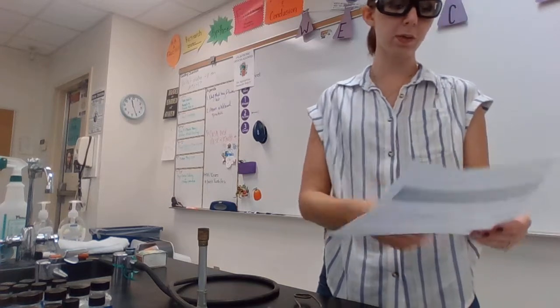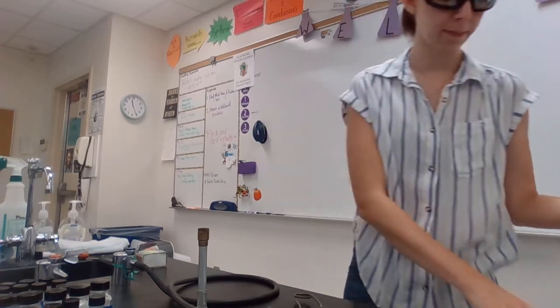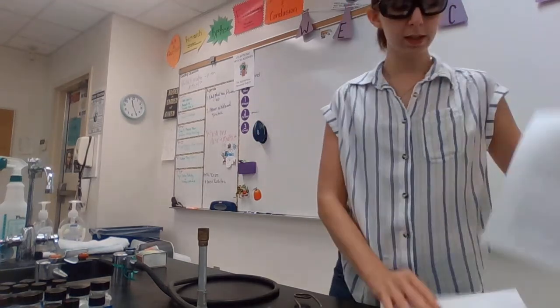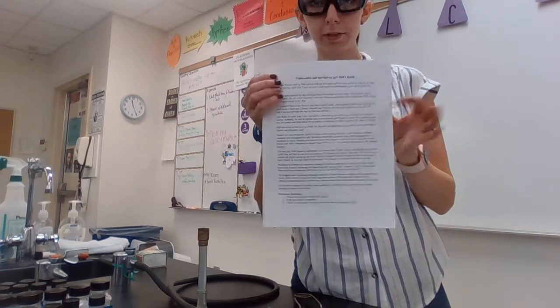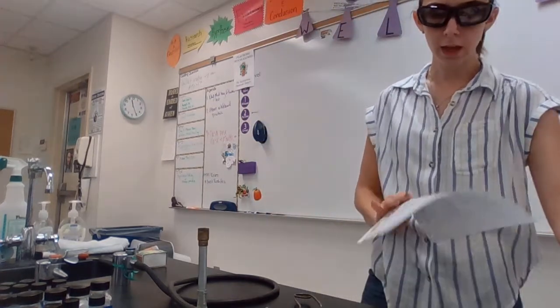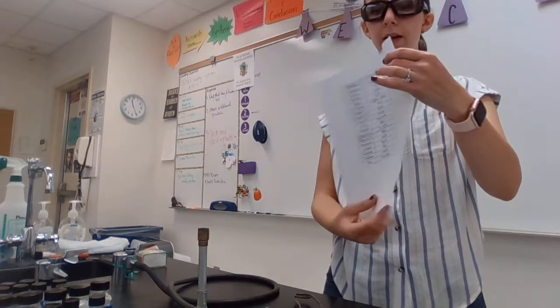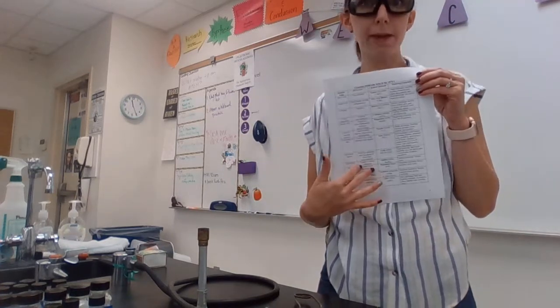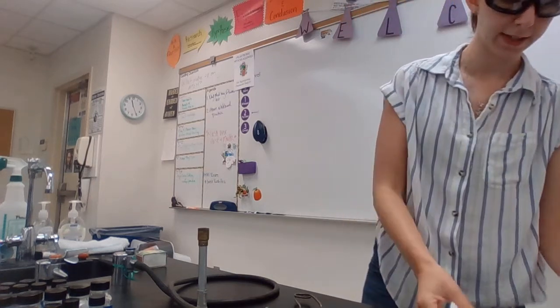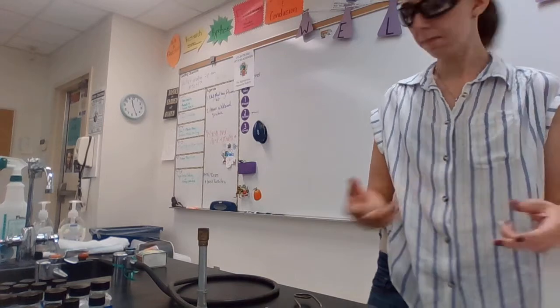We'll gather our evidence. We want to know the color of the flame, the possible element that is that color, and then the possible medicines from that. On the documents beforehand, you have the pre-reading. The back is the steps to the lab. You have what elements produce which flame color, and then on the back, what medicines those might be in the bottles that you'll hypothesize.